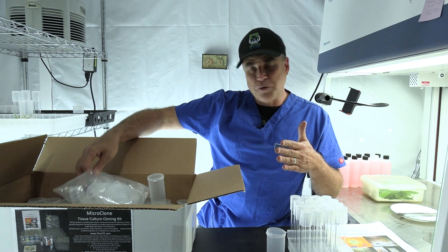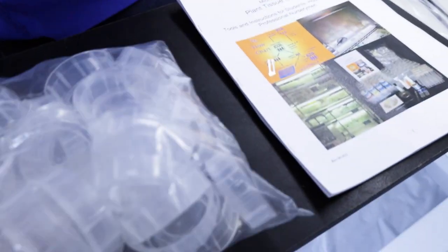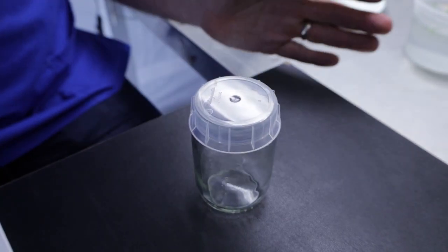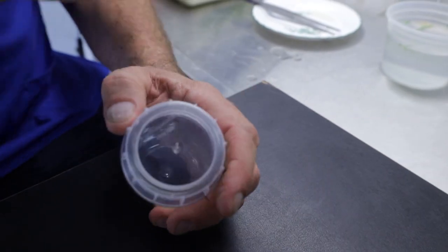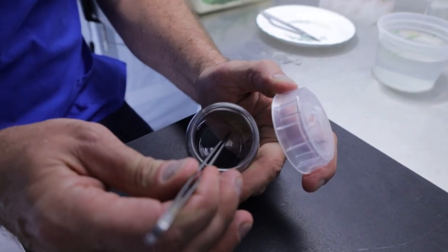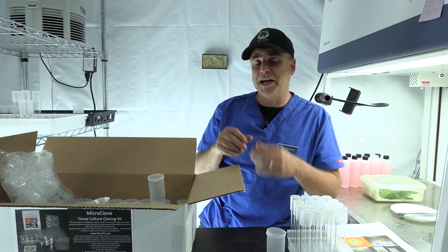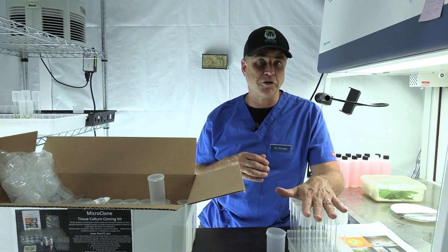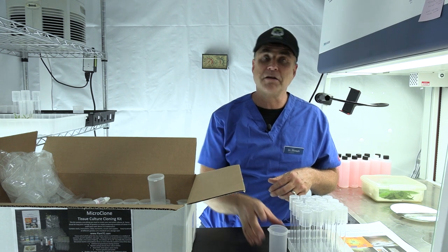I also include 30 of these glass baby jar lids. These are included because the large-size baby jars are available at all grocery stores — yes, they're going to contain baby food, but it's usually not hard to find someone to consume them. These lids fit the jars and are a fantastic vessel for three plants, when your technique is clean enough to put three plants together in one container. Start with single-plant tubes to learn, and then as your technique gets cleaner, we'll be putting two plants in the clear plastic containers.